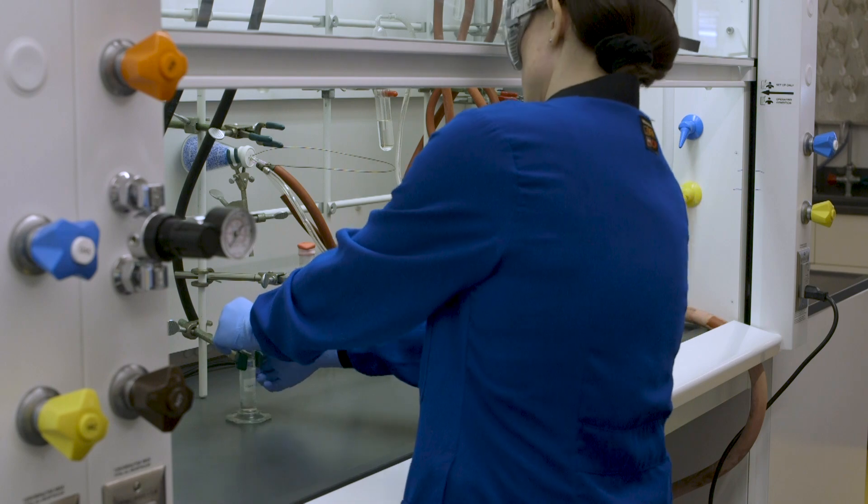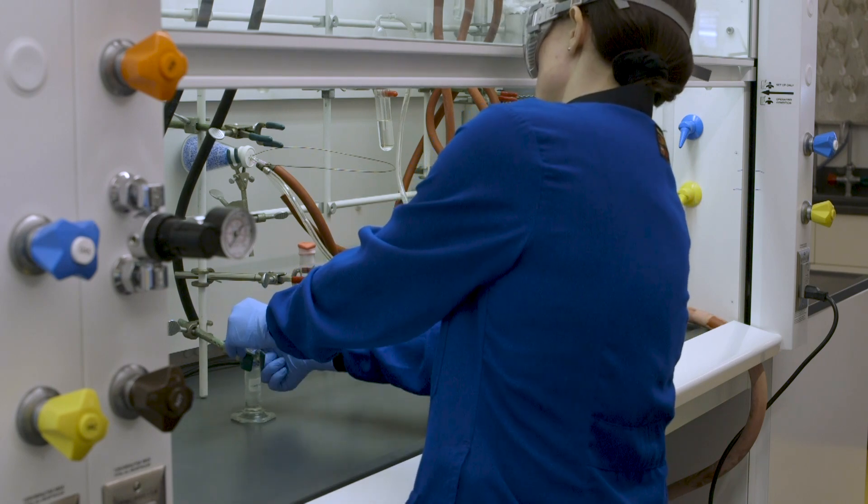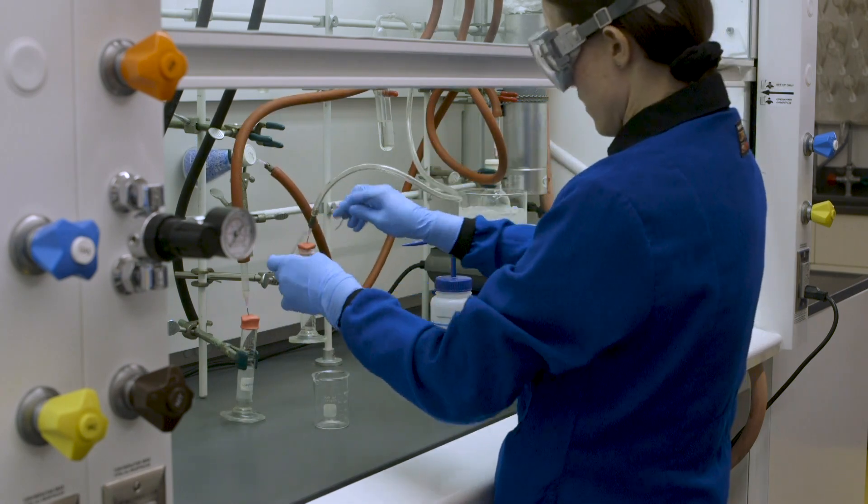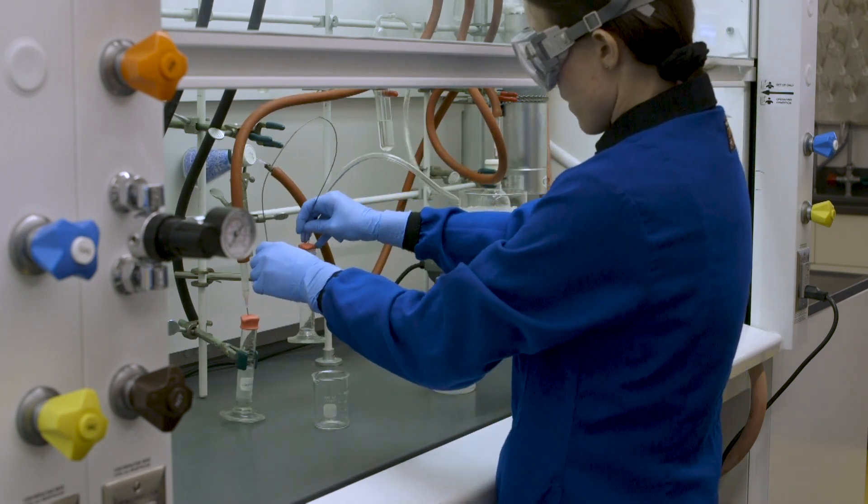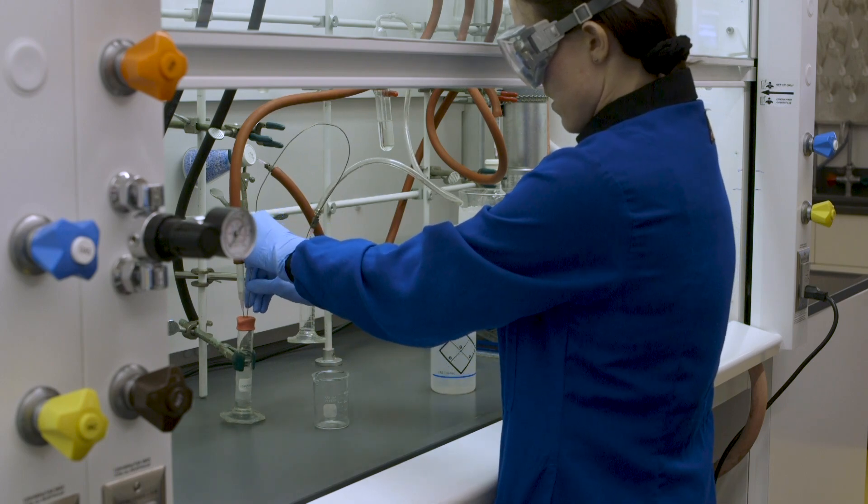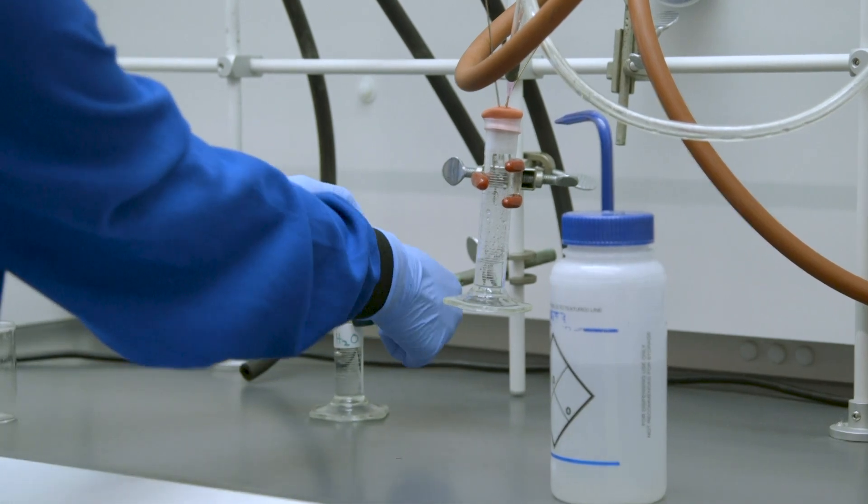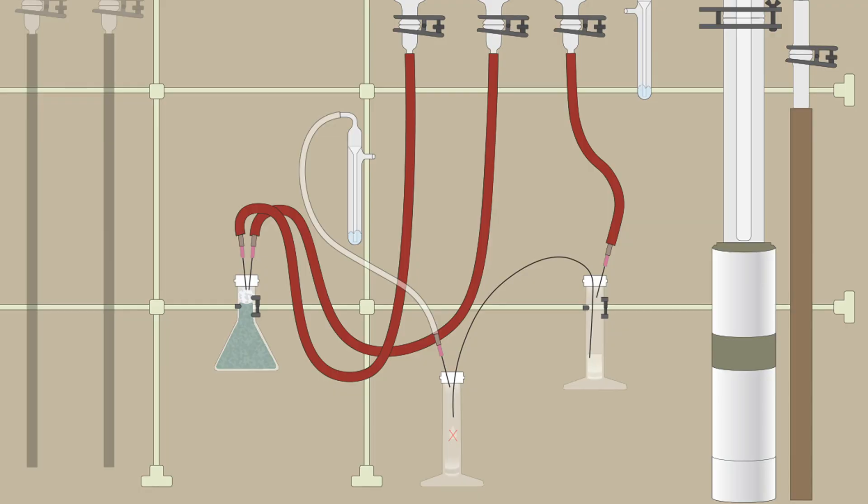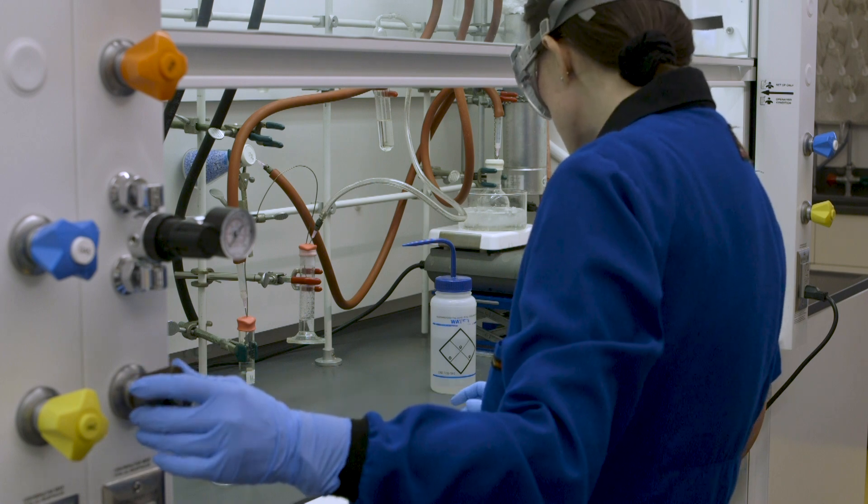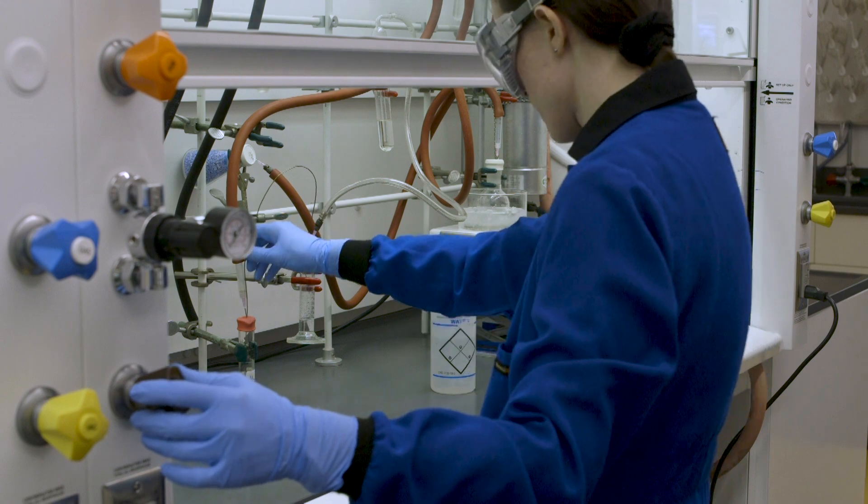The cannula must be quenched and cleaned so it does not become a hazard during future use. Start by initiating a transfer of solvent through the cannula and expelling it into a container of appropriate quench agent. Repeat as needed. Next, transfer an appropriate quench agent through the cannula. If the cannula becomes blocked during this step, remove the cannula and use a cleaning wire to attempt to clear the blockage. Be cautious as there is a small potential for small sparks during this step. If the blockage persists, soak the cannula in an appropriate quencher for at least one hour and dispose of the cannula in a sharps container. If there is no cannula blockage, clean it according to your lab's procedure and store it in the oven or desiccator for future use.